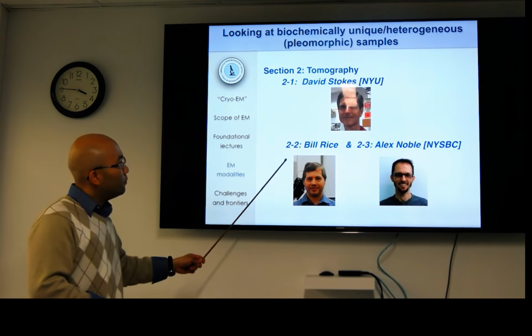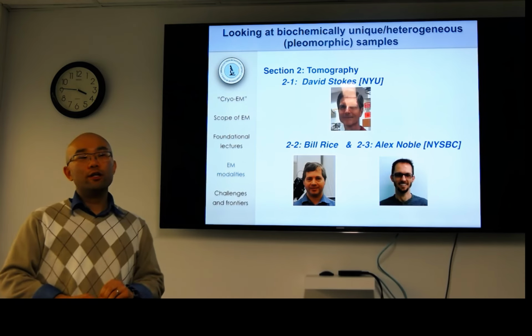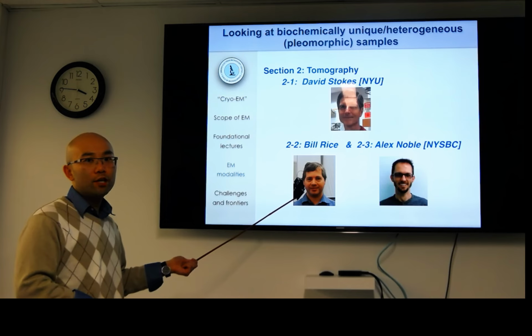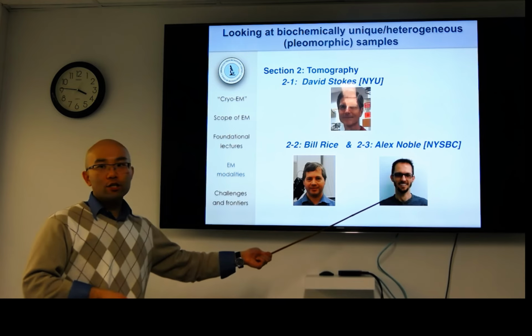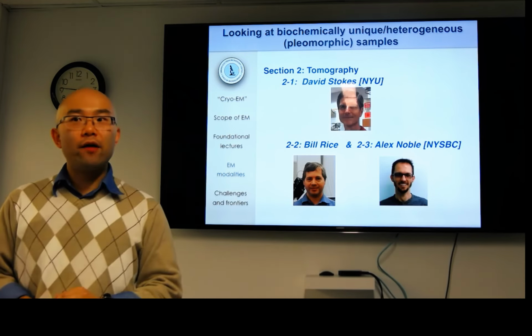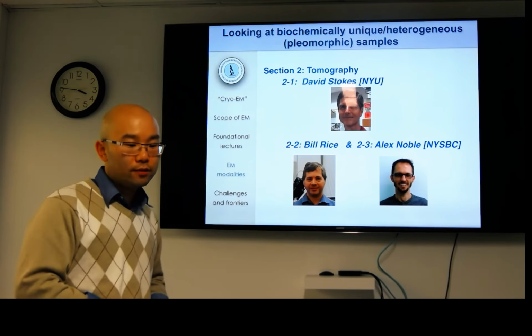Then Bill and Alex are going to talk about two emerging, interesting flavors of tomography. One is serial section FIB-SEM. That's a dual beam, focused ion beam, scanning electron microscope, as well as bringing single particle techniques to tomography, such as subtomogram averaging, and that's how you can push tomography to sub-nanometer resolutions.